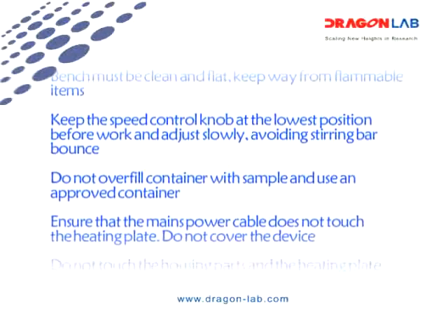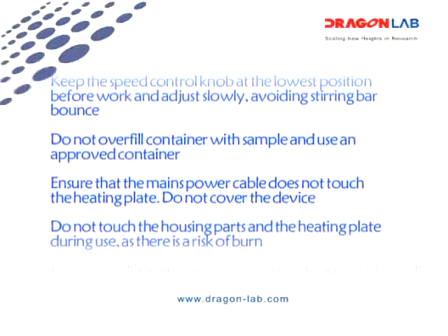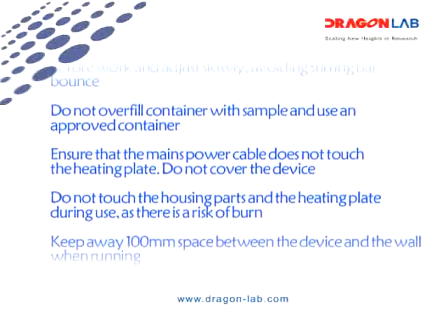Do not overfill the container with a sample, and use a proper container. Ensure that the main power cable does not touch the heating plate.